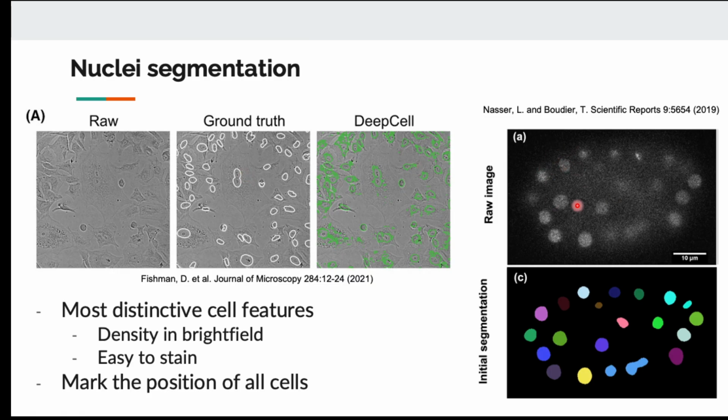Depending on how you take the image, different imaging techniques give you different types of pictures. But for each, there are algorithms that we can use to identify the individual position of the nucleus. For example, if we are using a bright field or phase contrast image, we might look at the texture, the dark area of the image.